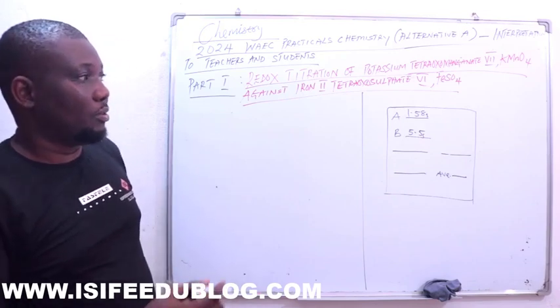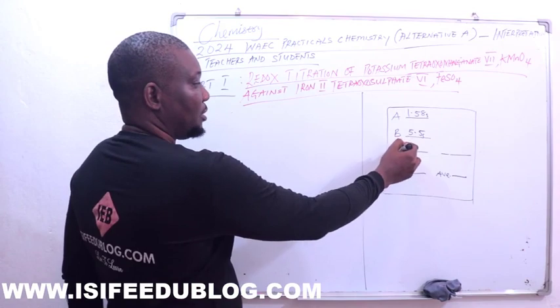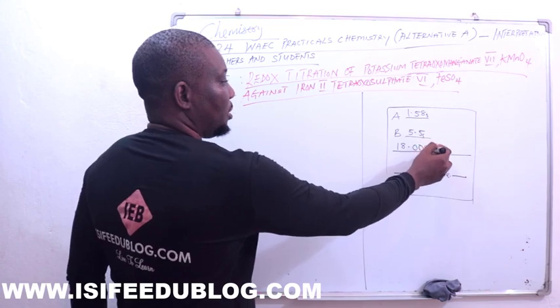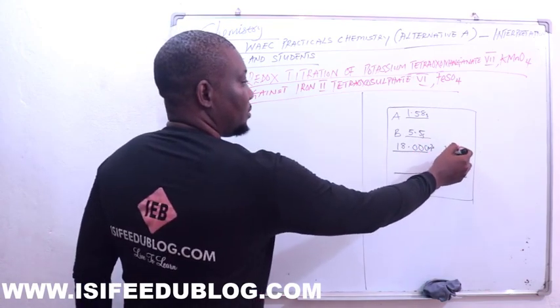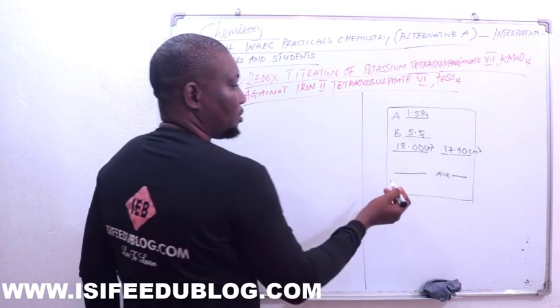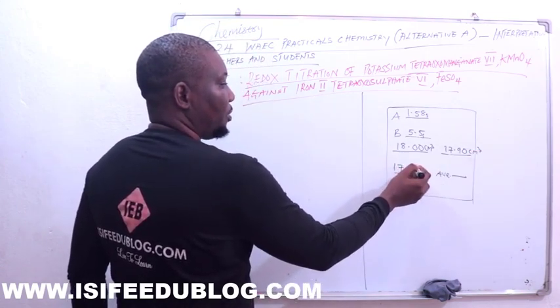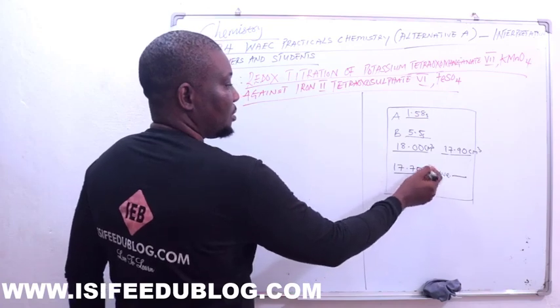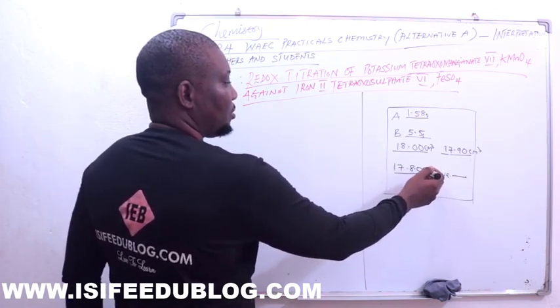In this video, we're going to be taking this as the end point. The teacher will be able to get 18.00 cm³, and maybe the next one 17.90 cm³, and the third one maybe 17.70, or rather 17.80 cm³.